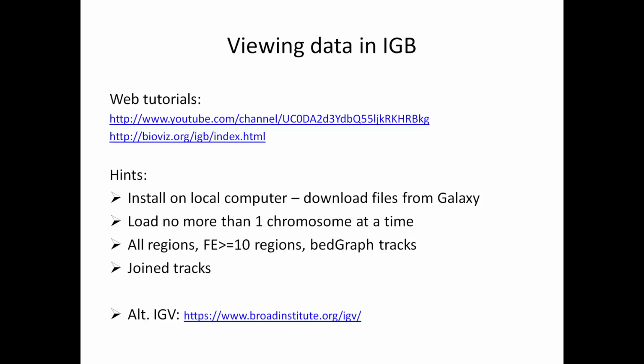It is also helpful to see the peaks, the coverage plots, on the genome. I generally use the UCSC genome browser to do this, as sessions or track hubs can be shared with people who use our services. These methods do require access to a web server, although people have apparently used Dropbox or other cloud services with differing success.